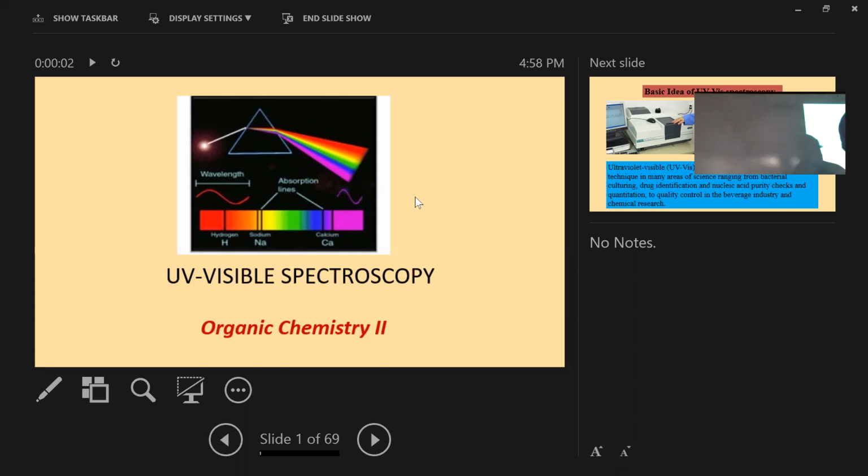You cannot see any light going through my hands because this is very rigid, or you can say this is too dark, or it absorbs most of the light, because otherwise, if it did not reflect at all, you would not see anything. But as it reflects something, you can see some light. So we will learn spectroscopy, that means the interaction of light with some matter. What happens, and what are the applications of UV spectroscopy? So, why is it working?